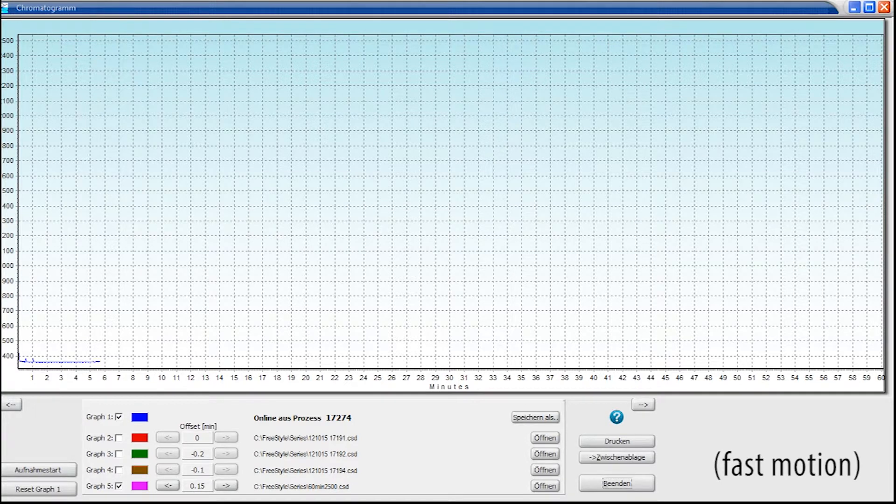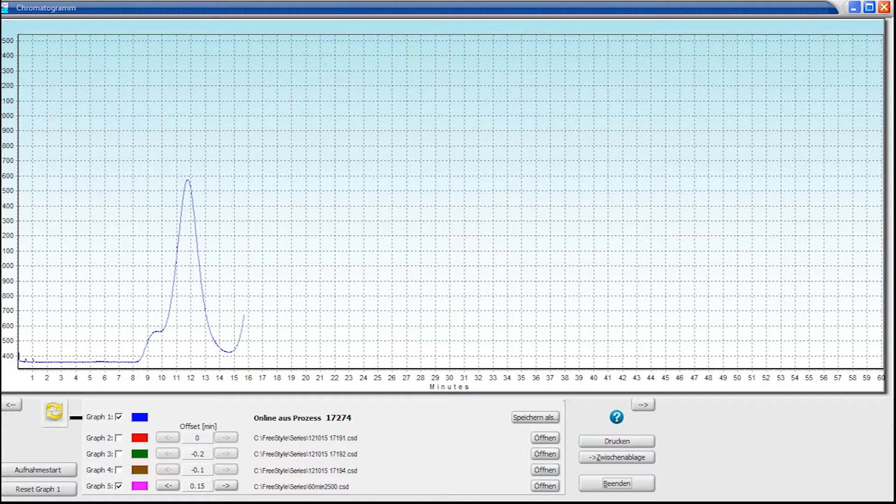The quality of the GPC column should be checked regularly by using a test standard to measure peak separation and shifting of the peaks. For this, you can apply a simple fixed wavelength detector.